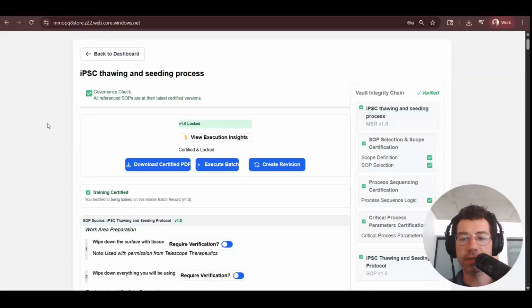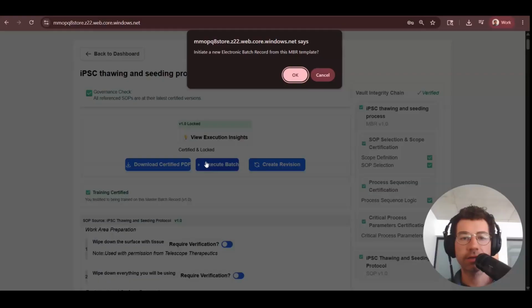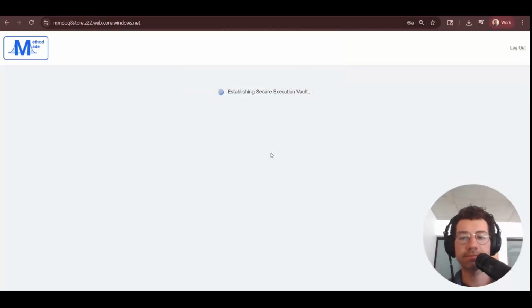Okay, so in this video, we're going to be looking at electronic batch record execution and completed electronic batch records. So here I am at the master batch record page for this master batch record. I'm going to click the execute batch button and click OK to start the execution.